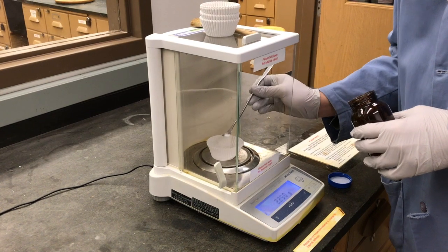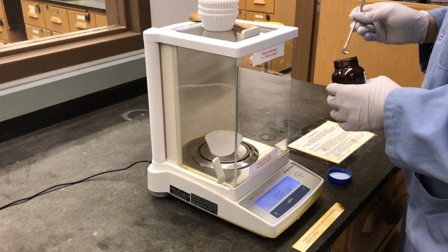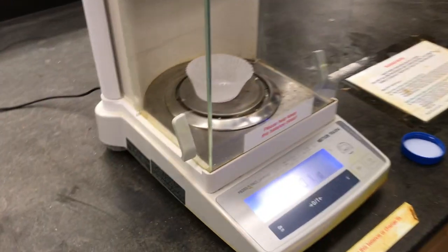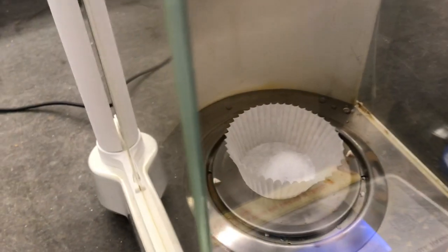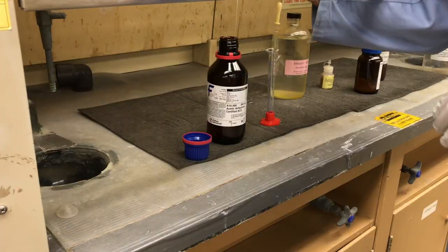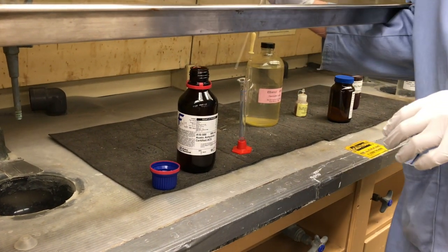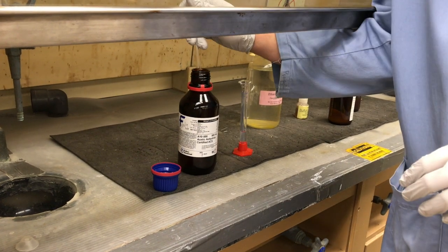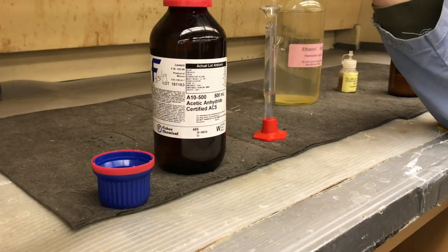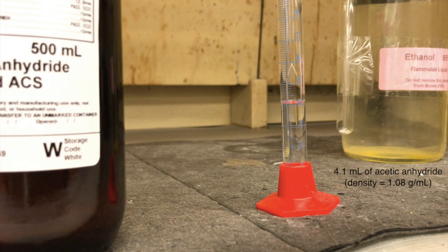Okay, we're starting out weighing the salicylic acid. We got just about 2 grams, 2.001 grams, and then you can see that it's a white powder. Next, we're going to measure out the acetic anhydride. We're going to try to get as close as we can to 4 milliliters. And make sure you don't forget to calculate the grams of acetic anhydride based on the density.